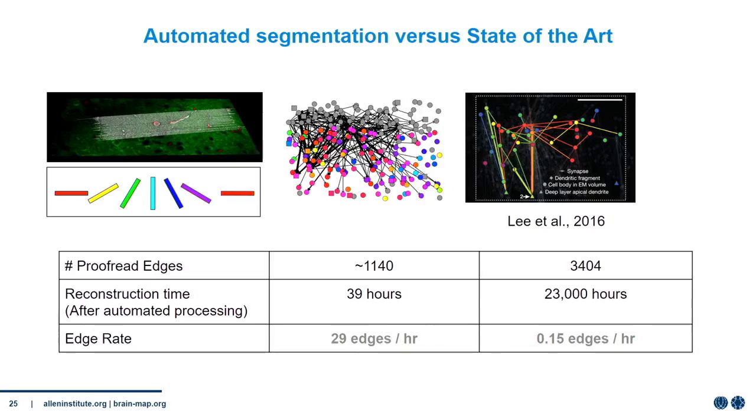So once Sebastian had reconstructed and we have combined the EM data set with the 2-photon, we can get a kind of a wiring diagram. And here's just to give you an idea of how much we progressed in the last year and a half. This is a paper by Clay that he started just before joining the Allen Institute. And this is basically the state of the art of published data in cortical functional connectomics.